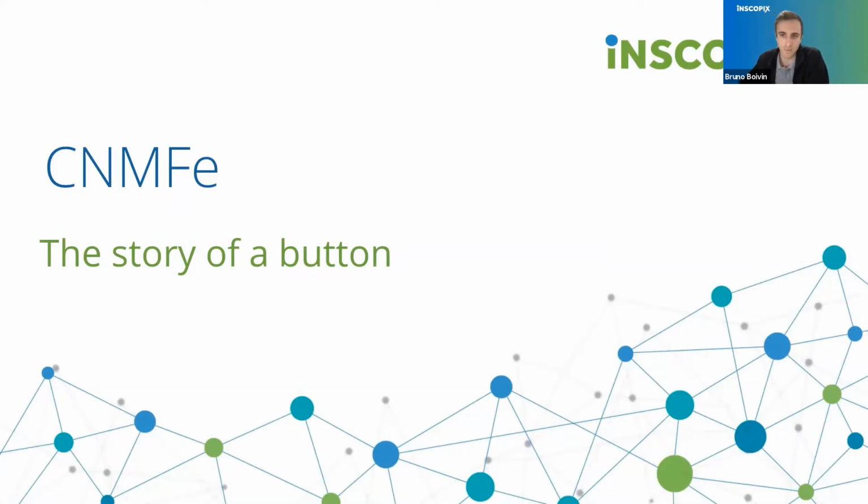With this re-implementation, one of the things that we did is that we've only made one implementation of CNMFE that's consistent across the board. So whether you use it in the application interface or whether you use the Python API or the MATLAB API, now you're going to get the same output, no matter how you use it.